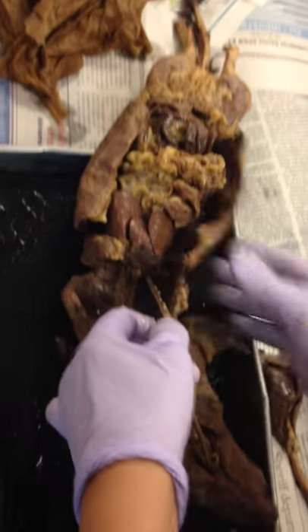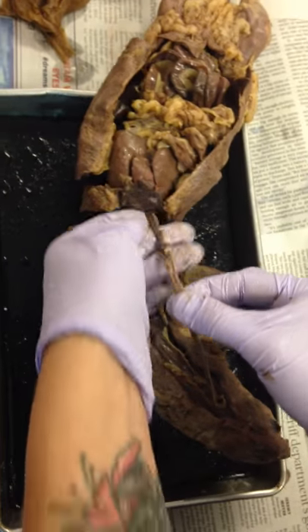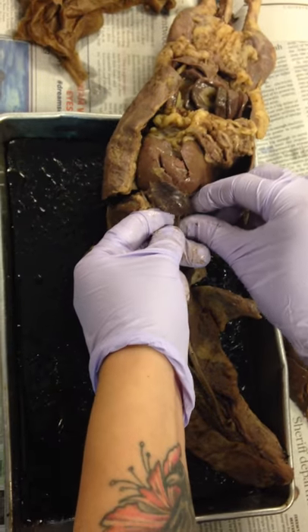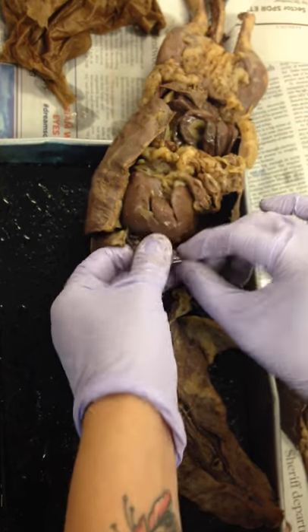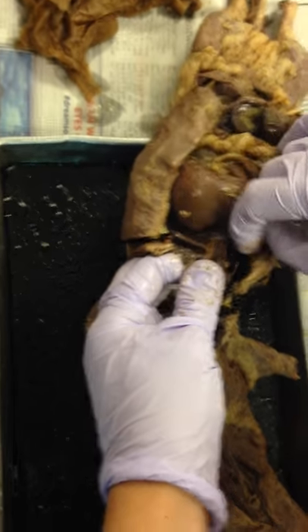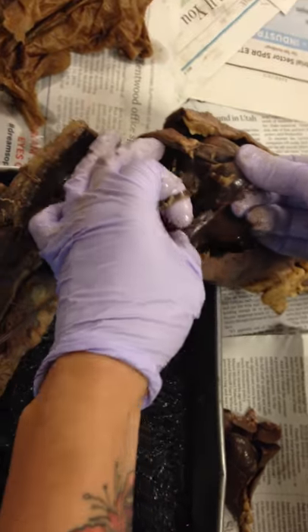Guys are going to find your esophagus and you're going to trail it all the way down, and you're going to be asking yourself that same question you were asking yesterday. Where's it going? Esophagus, where are you? What is your journey? And you're going to go from there. So you might see some connective tissue. And the first thing I notice is it's going to go straight through the diaphragm.